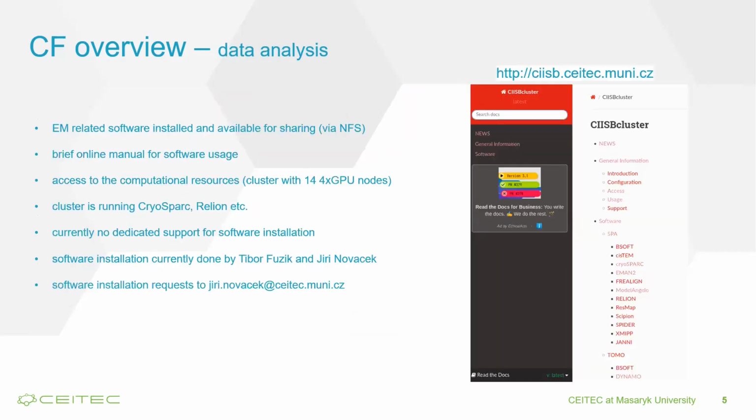So we provide support not only through access to the instrumentation, but we also try to help our users in the data analysis phase. For that, we are very grateful to the CIISB project, which supports our running. Through that project, we purchased a computational cluster, which currently has 14 nodes, each with four GPUs, and all of our users have access to that cluster.